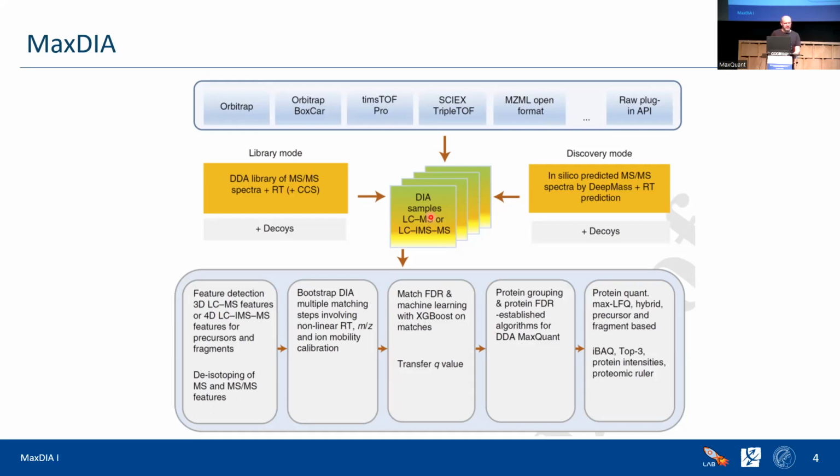So this is the one that has all the improvements. I mean, if you want to do DIA analysis with MaxQuant, use this version and not older versions, because it's really a quantum leap compared to what I described in the beginning.